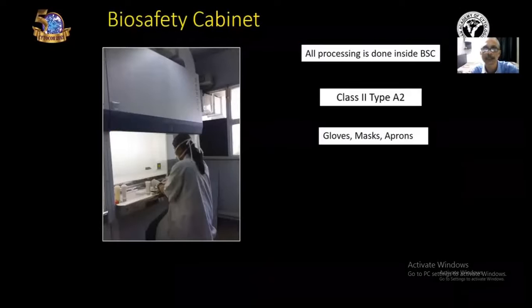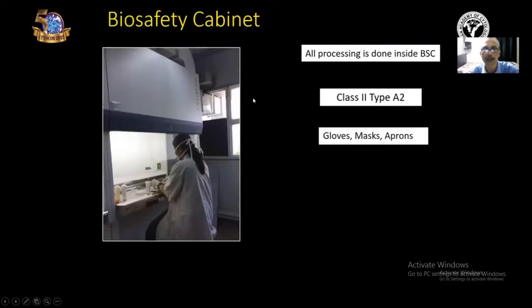All the processing is done inside a biosafety cabinet. Ideally, a class 2 type A2 biosafety cabinet is used. In addition, the personnel also wears gloves, masks and aprons.